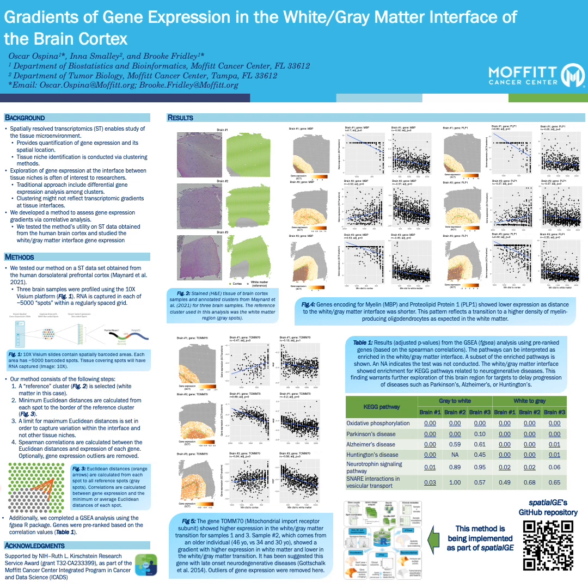In Figure 4 we show that the method correctly detects a gradient of expression of two genes. The gene producing myelin and the gene producing the proteolipid protein 1 are highly expressed in the white matter region, but expression is reduced as one gets closer to the gray matter interface. This is expected as oligodendrocytes, which produce these proteins to support other brain cells, are highly abundant in the white matter.